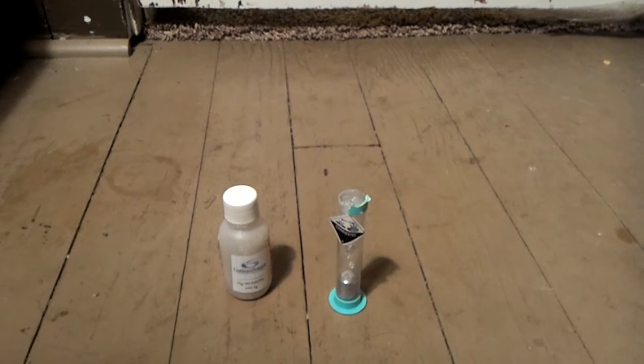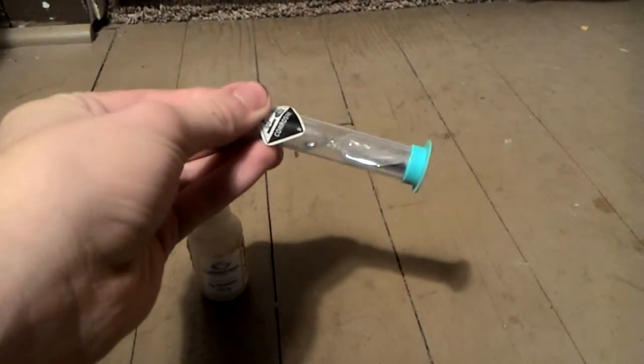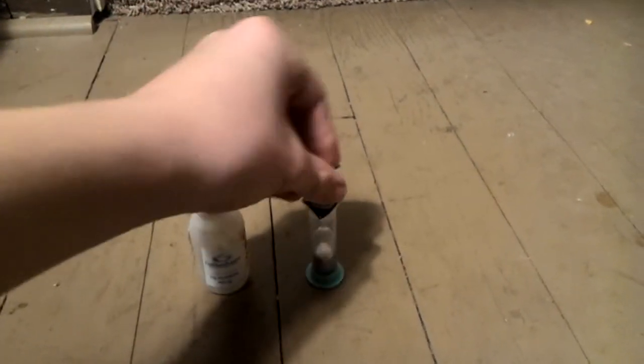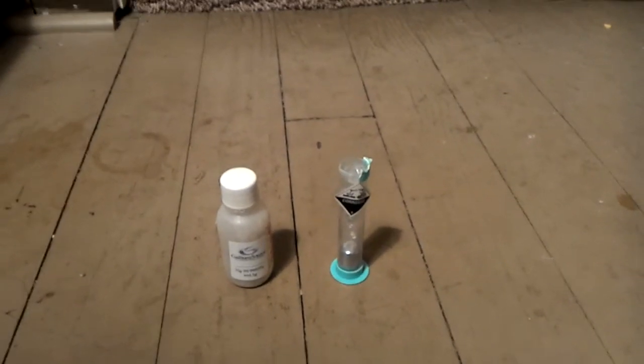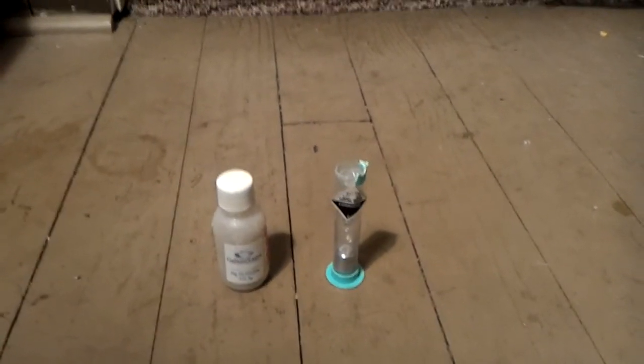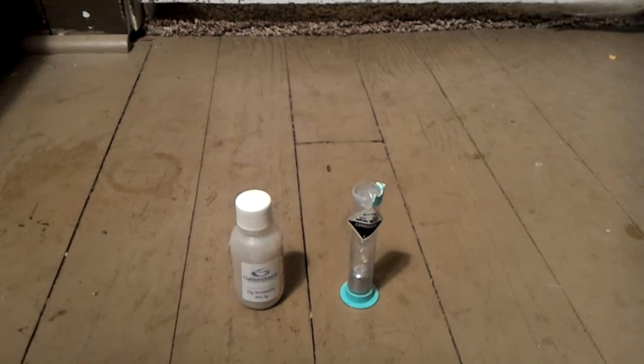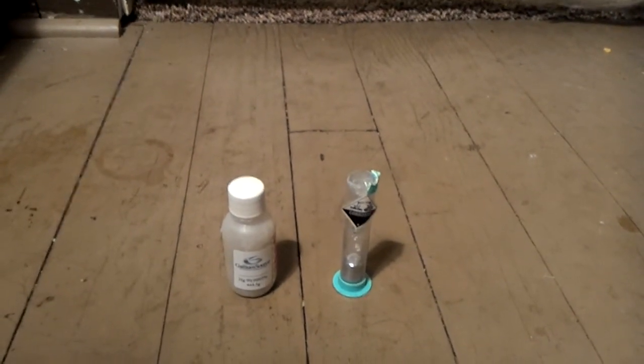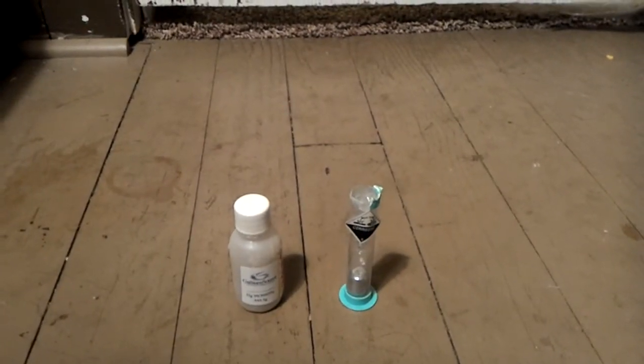So, that's my input on the subject. I don't know. So, I think the best option for somebody that's trying to store mercury is glass air combo. Because, it doesn't seem to have done anything. And, even if you increase the surface area on the mercury. Like, get a bigger jar of it. It still won't do anything. I have a bigger jar. And it just looks exactly the same. Maybe with a little bit of film. But that's because I've opened the jar multiple times. So yeah, that's my input.